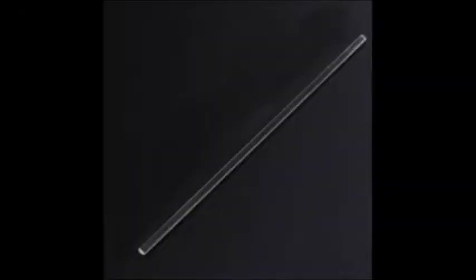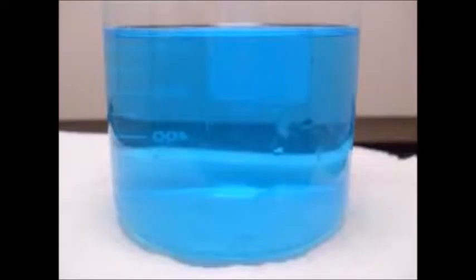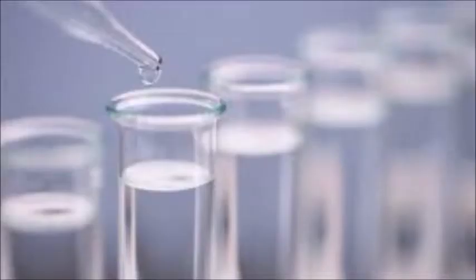Materials: well, for our experiment on determining limiting reactants, we used 2 burettes, a metric ruler, 8 test tubes, a stirring tool, and a graduated cylinder. For chemicals, we used potassium hydroxide in amounts varying from 1 to 8 milliliters, 8 amounts of 5 milliliters of copper(II) sulfate, and amounts 1 through 8 milliliters of water.